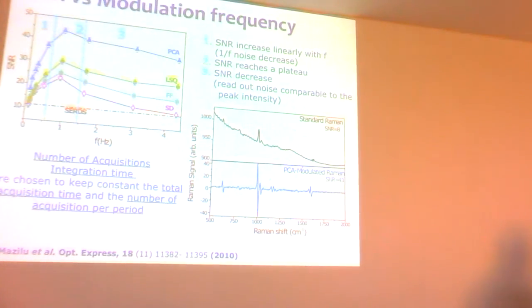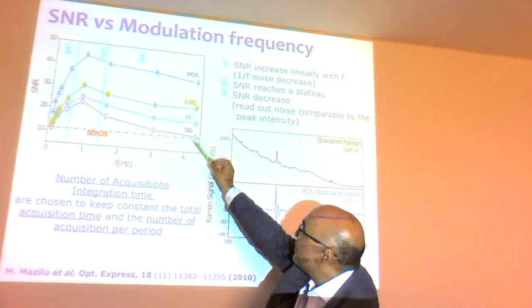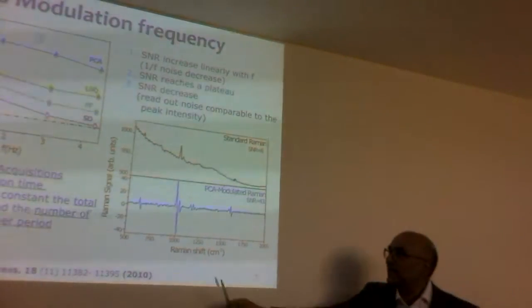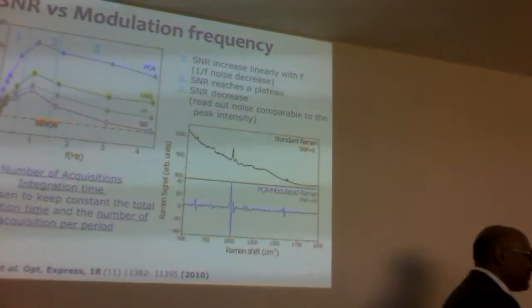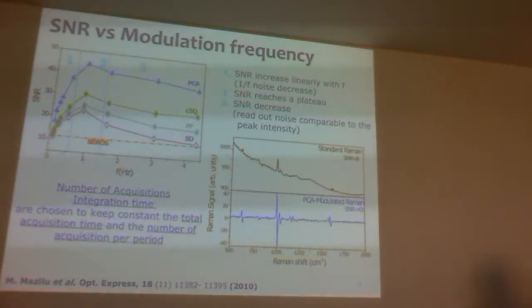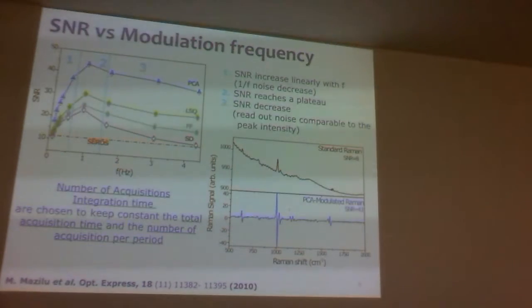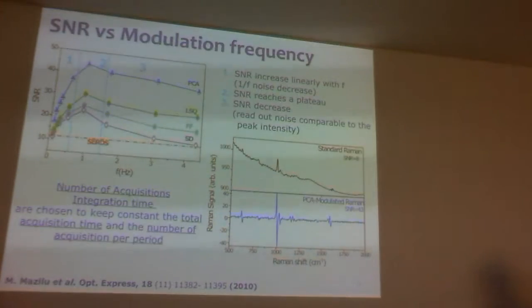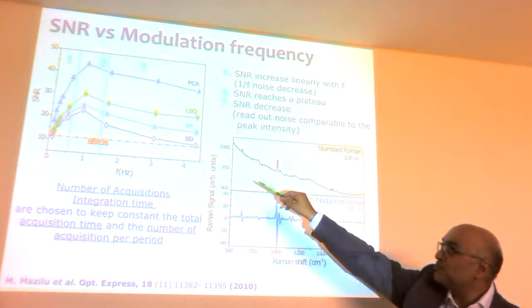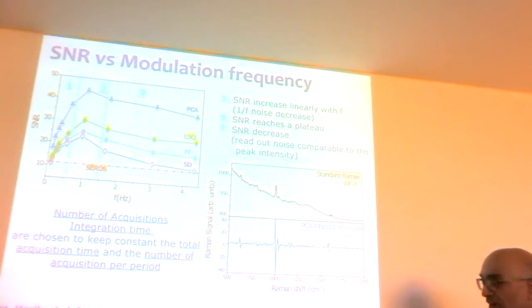Now, as you do this, you can look at signal-to-noise in Raman, and do analysis of all these methods. Here, as we move the frequency of juddering, we get a peak around about number 2, in the middle here, which seems an optimum for this particular sample, which I don't know off the top of my head which one it was. And you'll get that for any peak. That makes sense, because you have to dwell on the sample long enough to get some Raman photons out. As Colin was alluding to, signal is very important, but really what matters is signal to noise. You have some background, but you need to extract enough signal for Raman or whatever you're doing before you can move on to the next point. And if you do that, you find there'll be an optimum trade-off between how quickly you can go and what method you use. It's an interesting challenge to work those out.